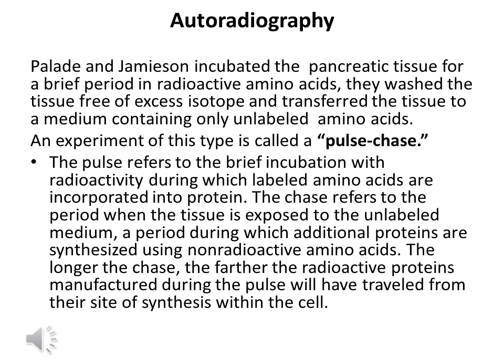So, the longer the chase, the farther the radioactive proteins manufactured during the pulse will travel from the site of synthesis within the cell. We can fix the cell at different times and look at where the protein is synthesized and where it is transported. The location of a particular protein or cargo in the cell can be determined by this experiment.